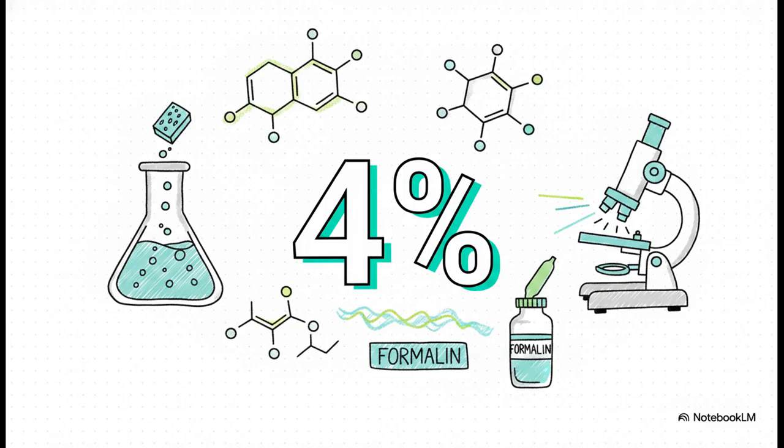And hey, here's a wild little lab fact that often catches people off guard. A standard 10% formalin solution, which is pretty much the cornerstone fixative in virtually every lab, actually only contains exactly 4% dissolved formaldehyde gas. It's crazy, but in this field, precise chemical ratios are absolutely everything.